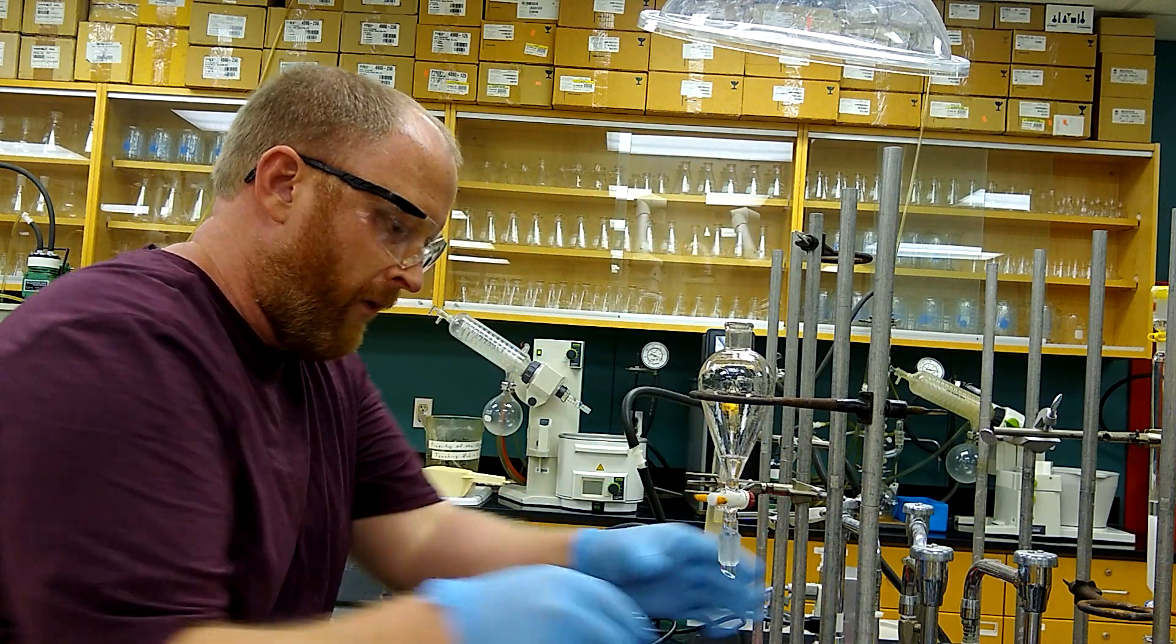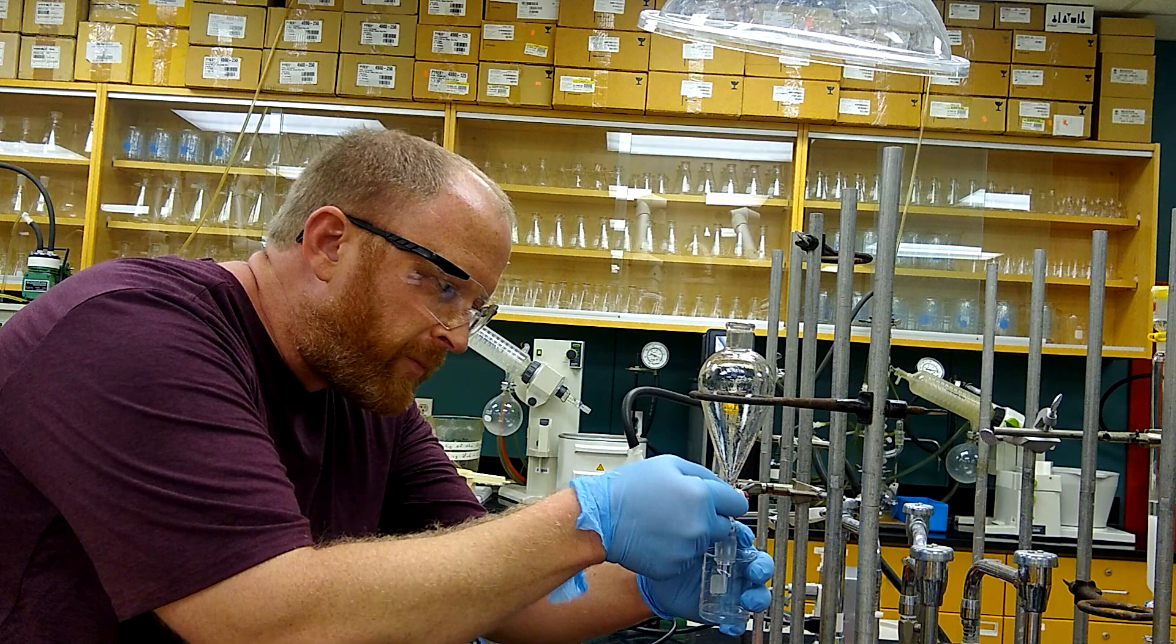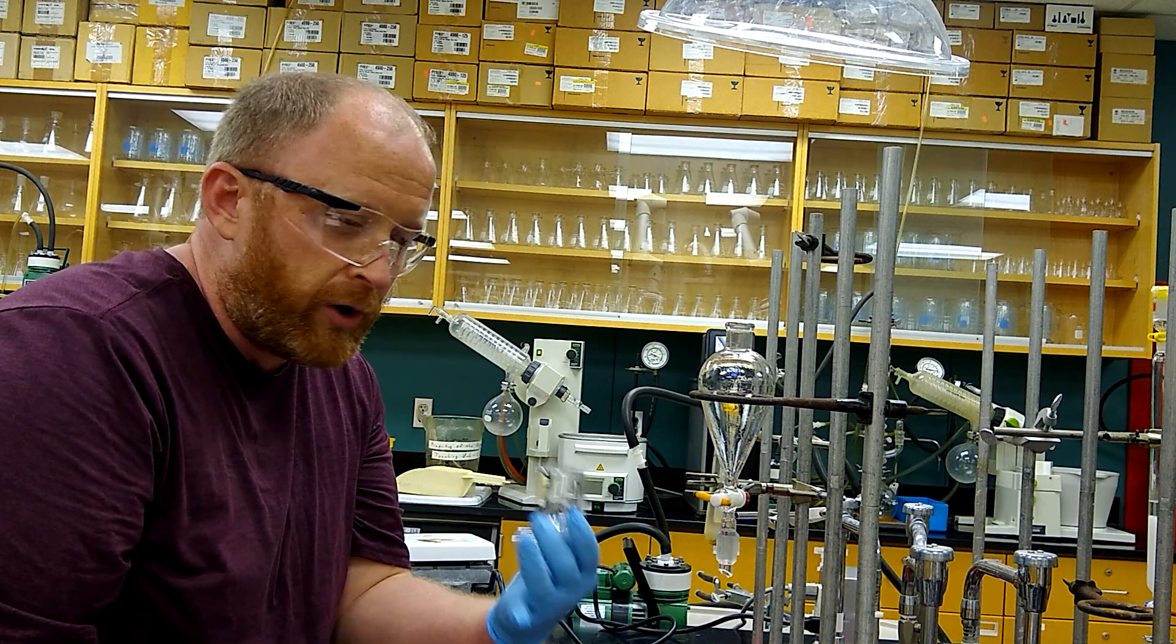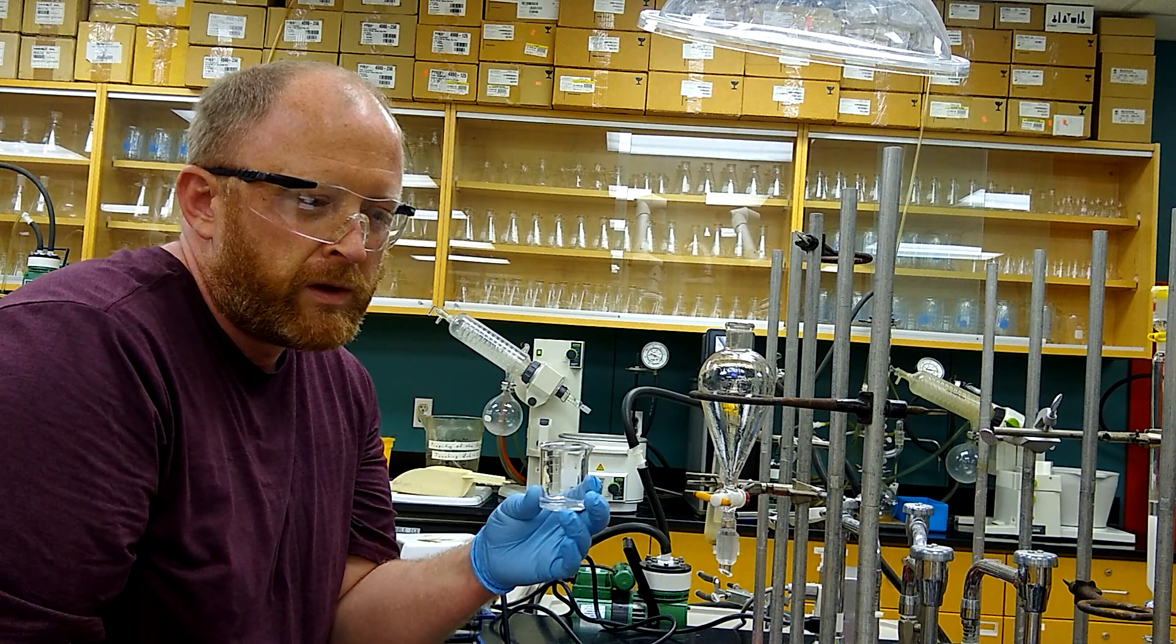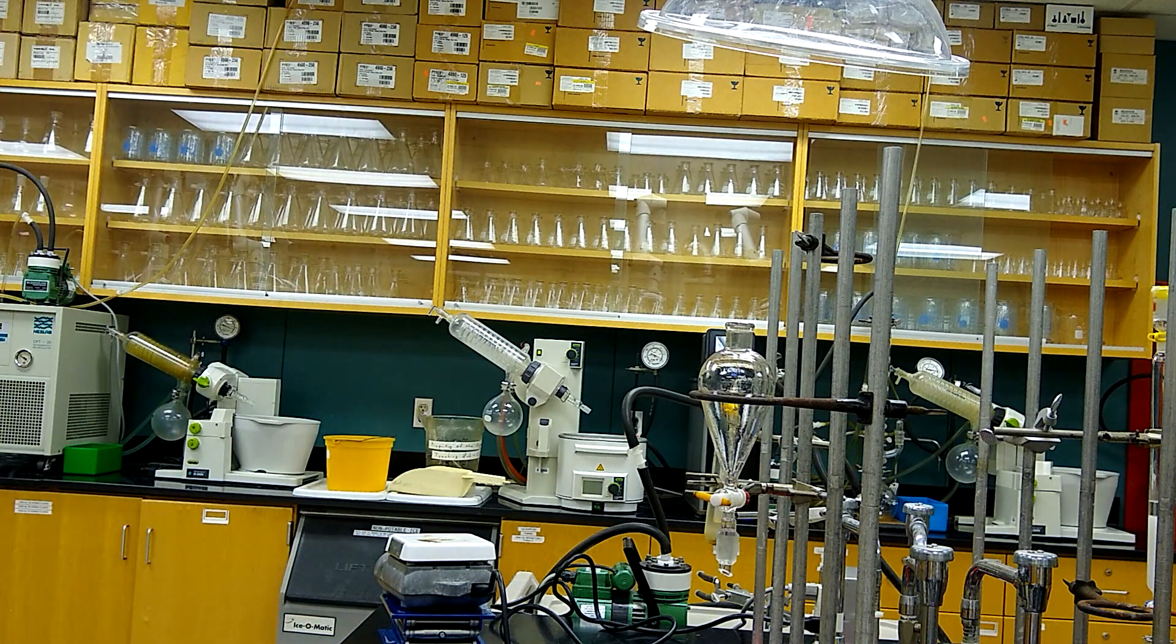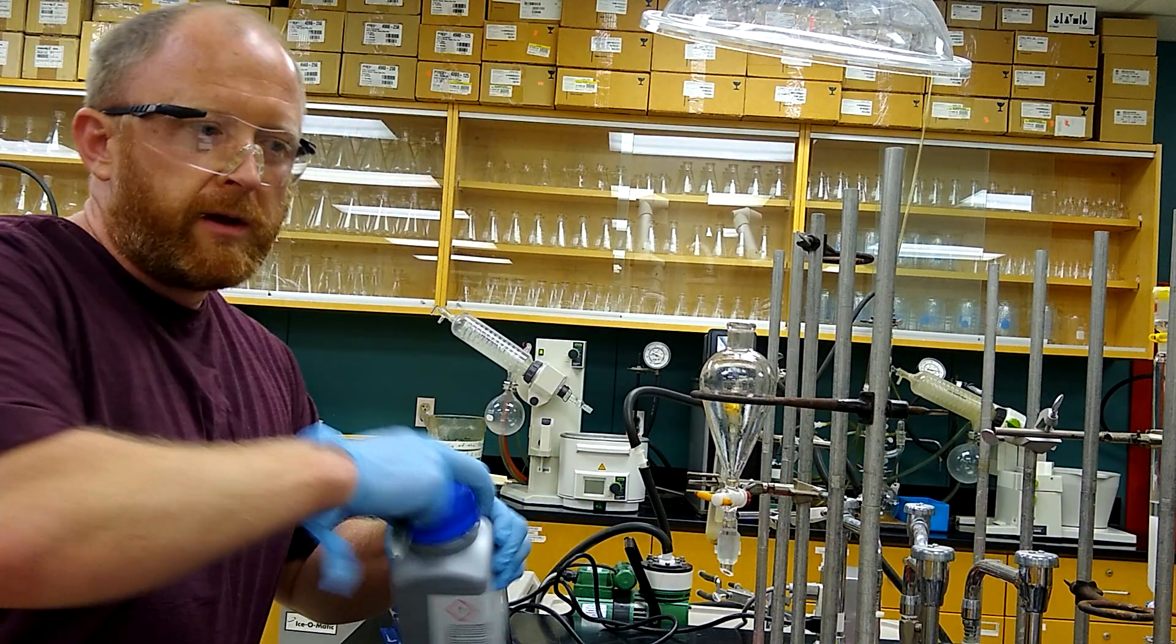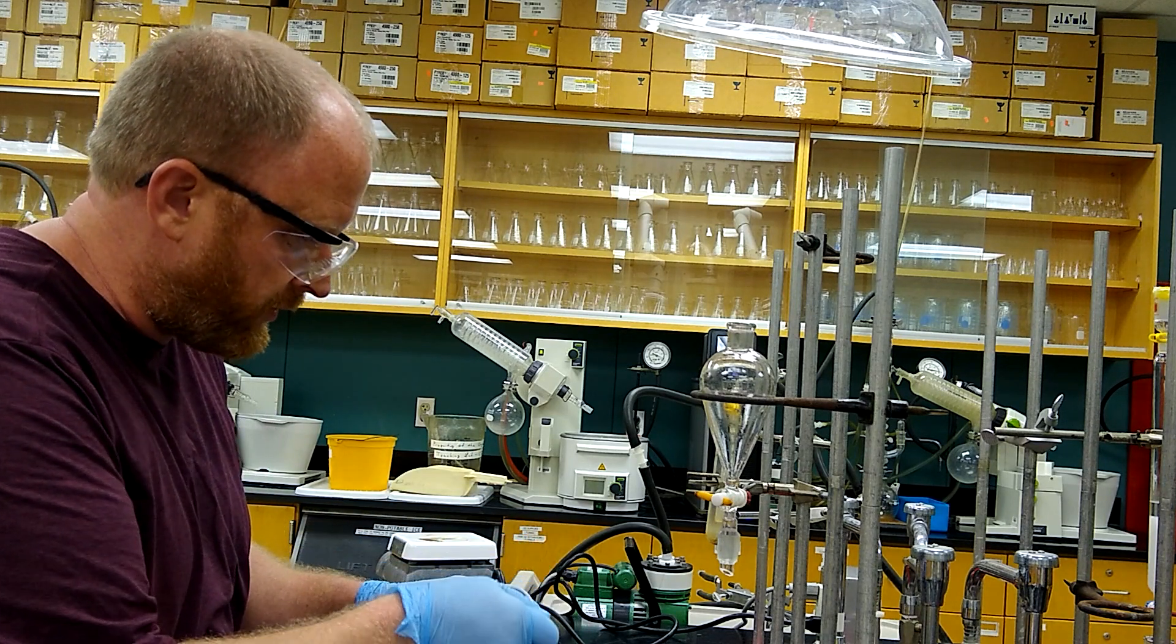What we should have at this point in the ether layer is some of our product, the propyl tolyl ether, and then there will be some of the excess bromopropane since we used an excess relative to the cresol. Now since we could have some traces of water from the water wash, I'm just going to add a little bit of drying agent.